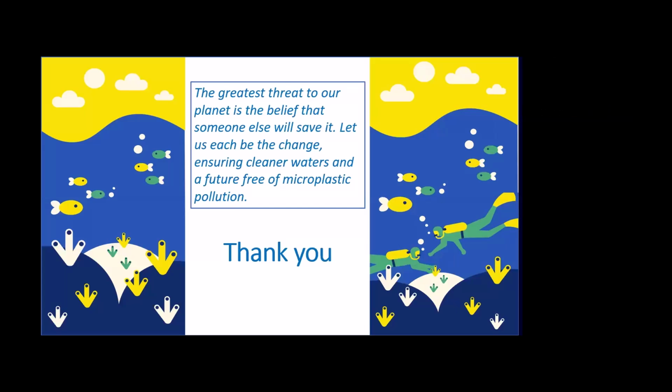If I'm to answer Udara's question about using the UV method to analyze microplastics, it is just an indication. You can do that, but it is not a standard method.